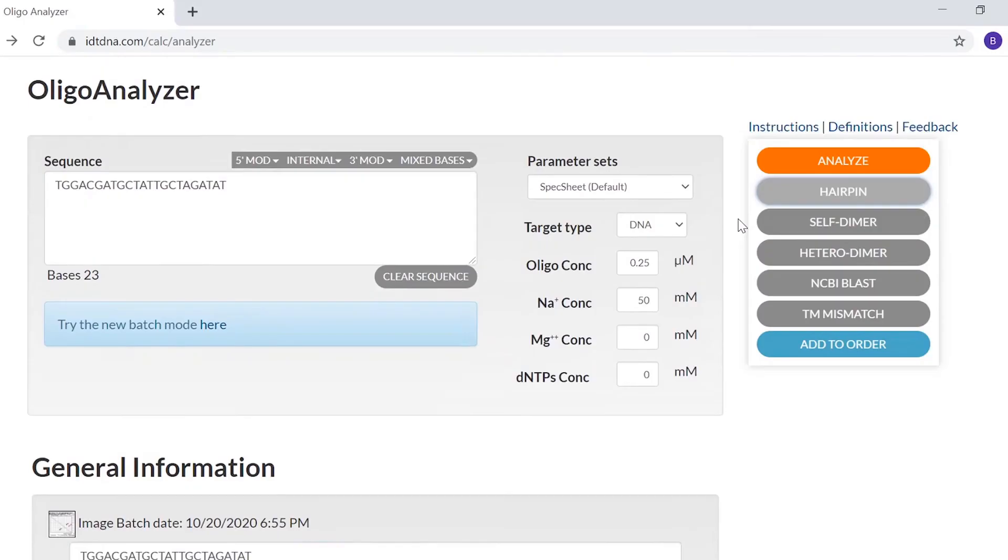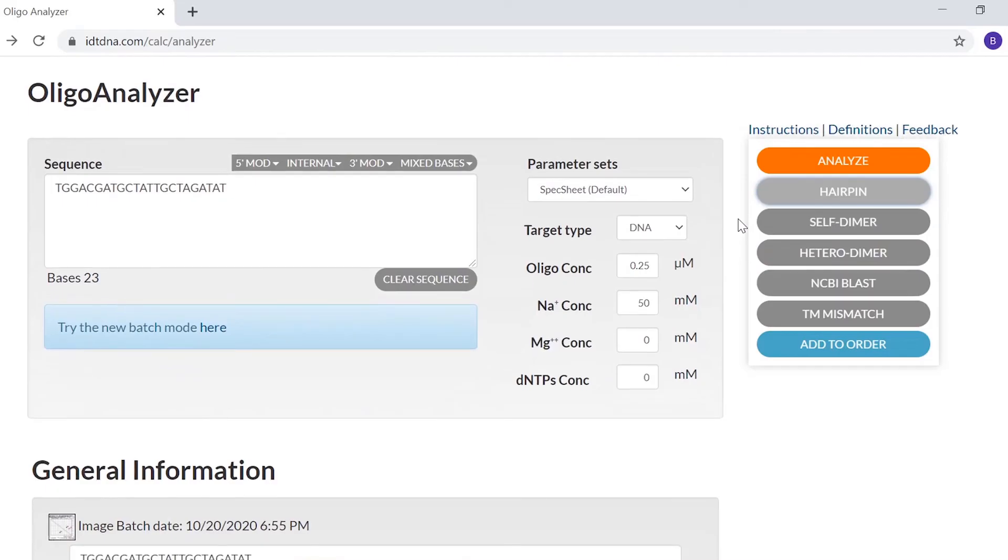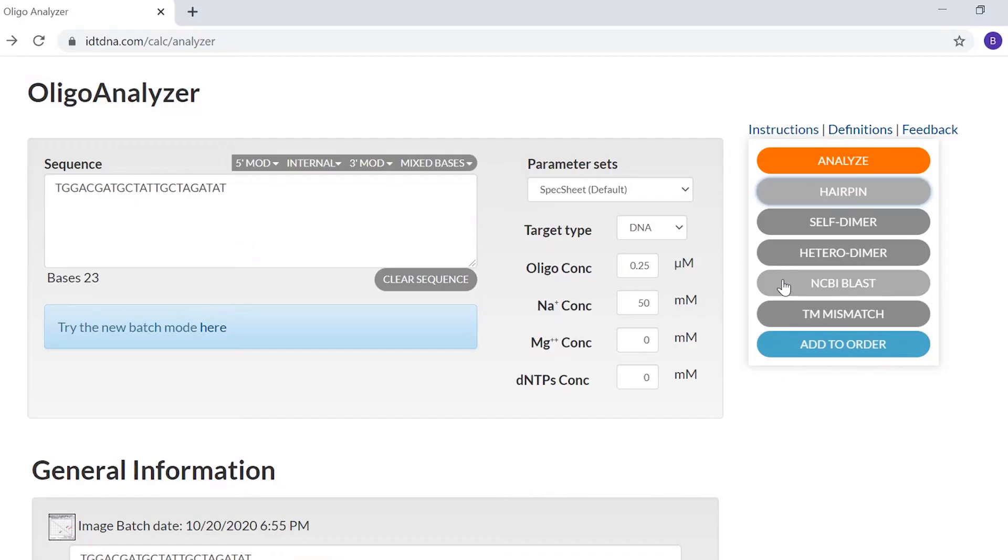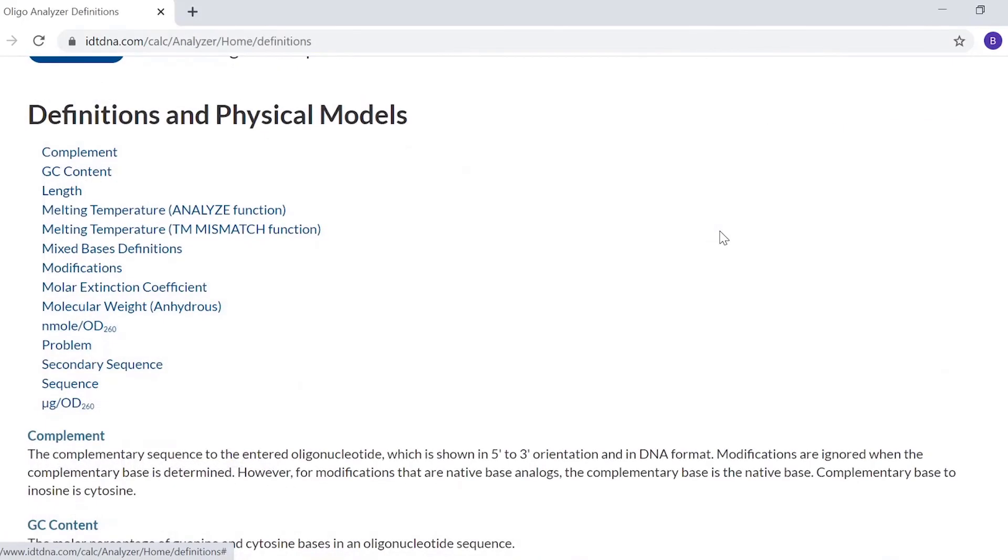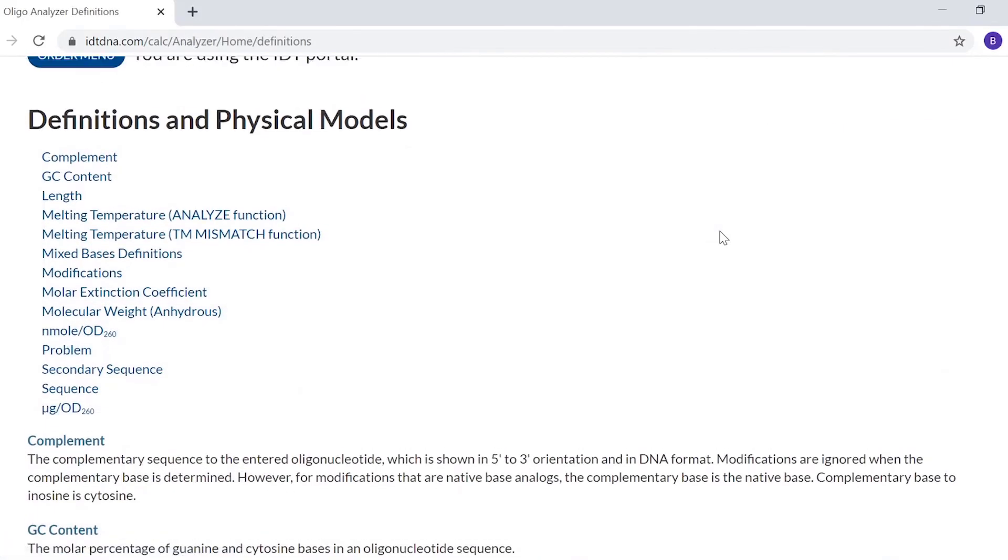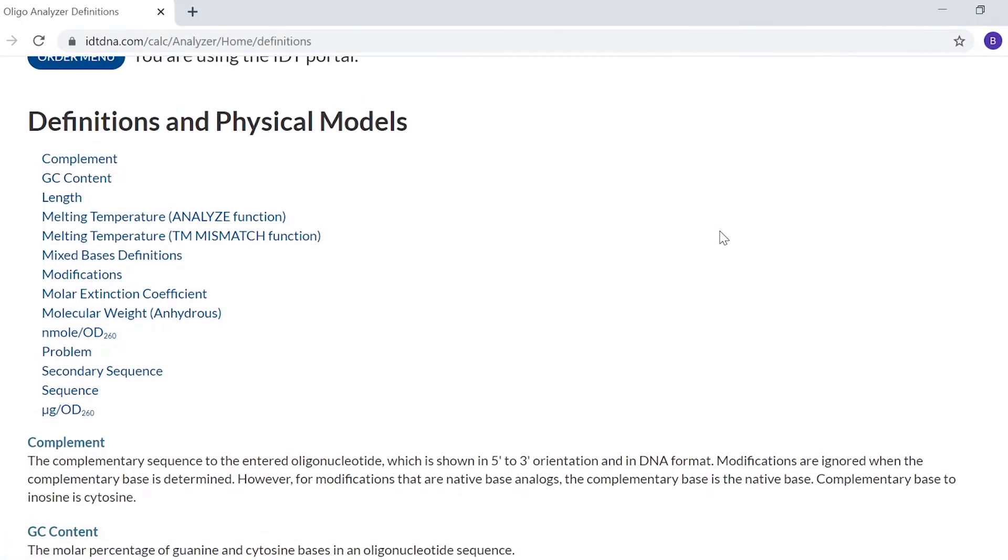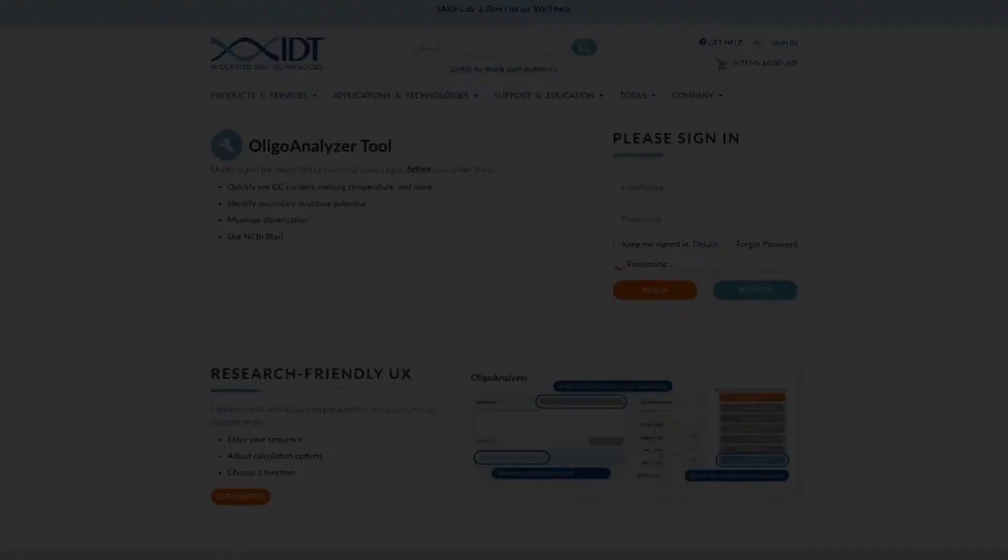There are many other features available in the IDT Oligo Analyzer tool, including the ability to add a sequence to an order using the Add to Order button. There is also an NCBI BLAST function, as well as a melting temperature mismatch function. If you ever need a bit of help, the Definitions tab provides descriptions of many terms. It also has background information, including algorithms and references.